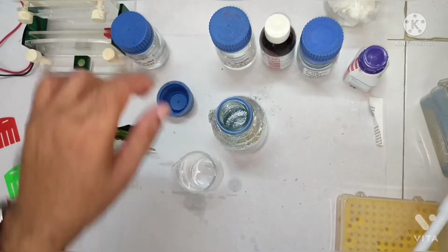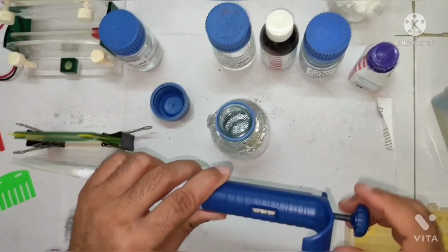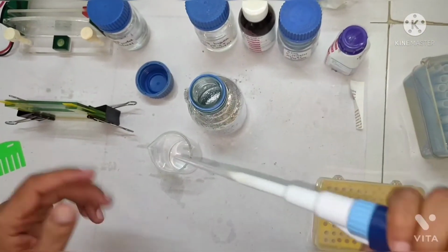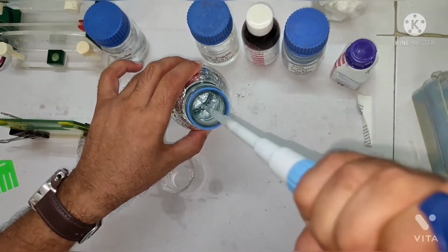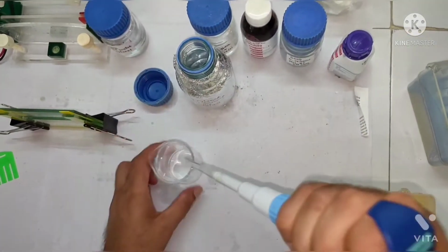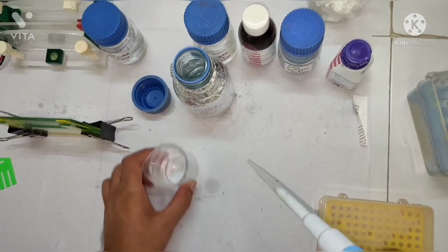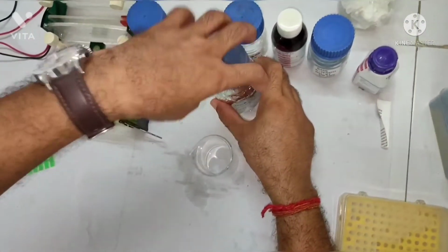Then 30% acrylamide, 0.67 ml. Again you refer to the table. So I'm setting 0.67 ml here. We used water, so we can use the same tip here. This is the acrylamide and bisacrylamide solution. You add and mix it properly again, because mixing is very important here. Mix it and then discard the tip.